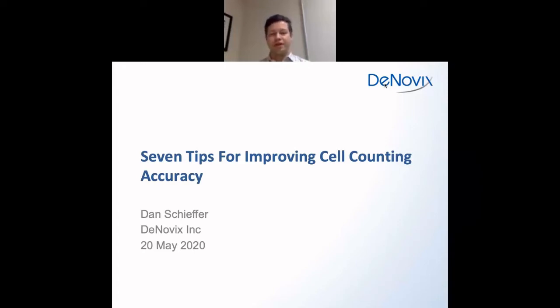So the goal today is to give everybody an overview of cell counting and then just a few things to keep in mind while you're doing cell counts, so that the process will still be quick, but hopefully it will be more accurate as well.